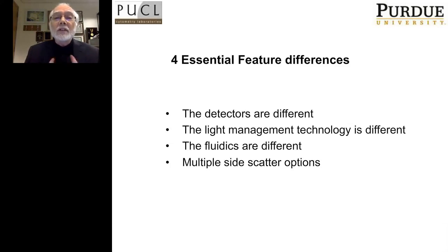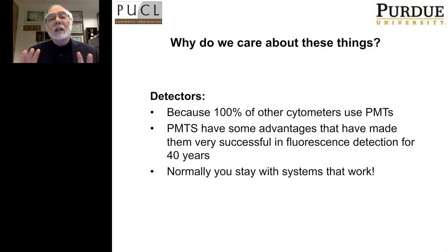So the detectors are different. The light managing technology is also different. The fluidics are different, and it also has multiple violet side scatter options. So I'm going to talk about those features. The question that one might ask is, why do we care?